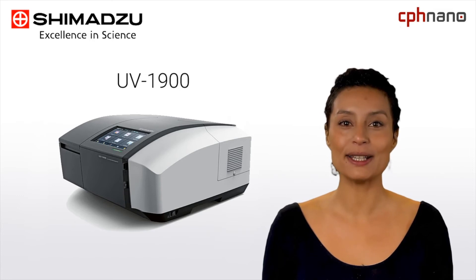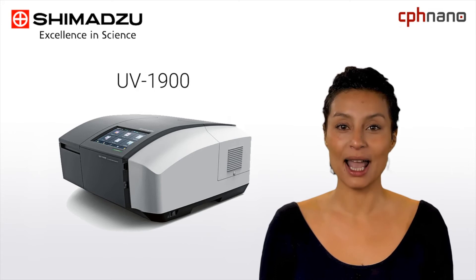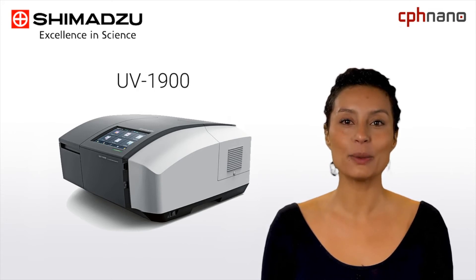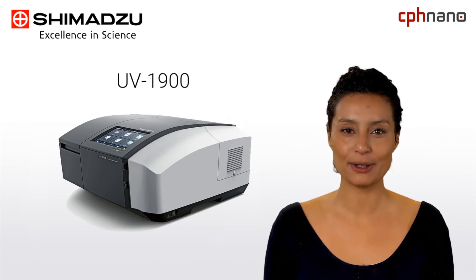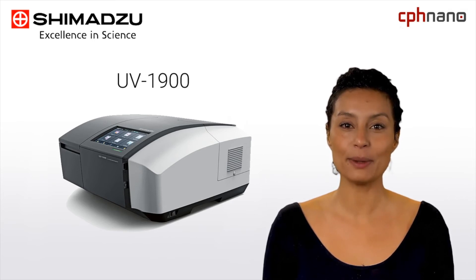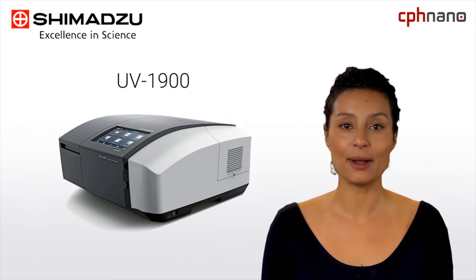In 2018, Shimadzu introduced the UV-1900 model to the market, emphasizing the company's position as a world leader in analytical instrumentation, while maintaining the advantages within wavelength resolution and user-friendliness of the previous model. The UV-1900 has the fastest level scan function of the industry.